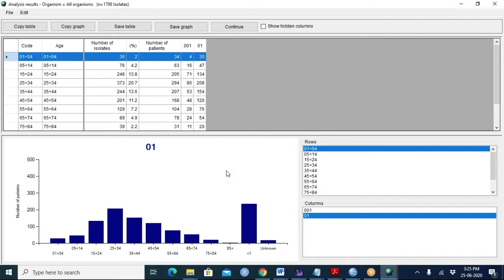If you look at one of these graphs and say, that doesn't seem right, you just say why you think it's not right. Question: if age information is missing, what happens to that information? Well, you see on the right-hand side, it says unknown. On the graph, the last graph item says unknown. Yeah, it's missing. It means we don't know what the age is.